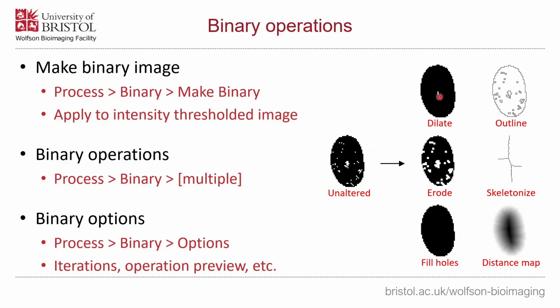However, this bit down the center here, which is slightly wider, you do still get a few pixels which are identified as being background. We have erode, which does just the opposite operation. So here, any foreground or black pixels that are in contact with at least one white pixel will be converted into a background white pixel. There are open and close operations which aren't listed on the right hand side here, but are available in that menu.